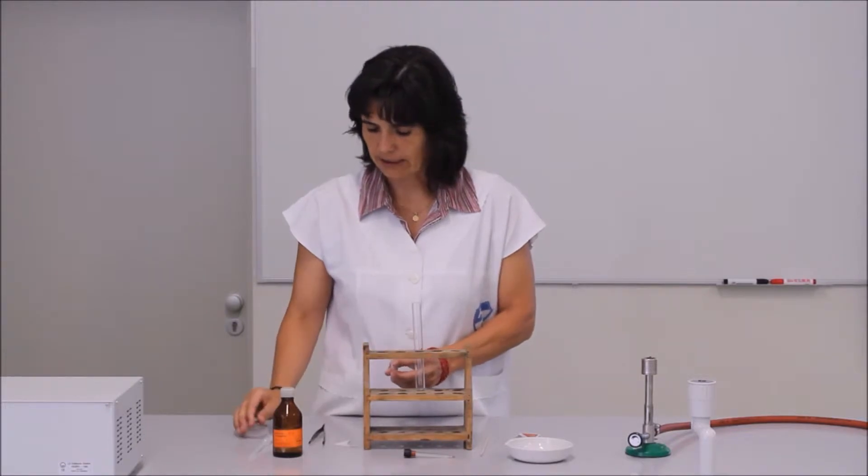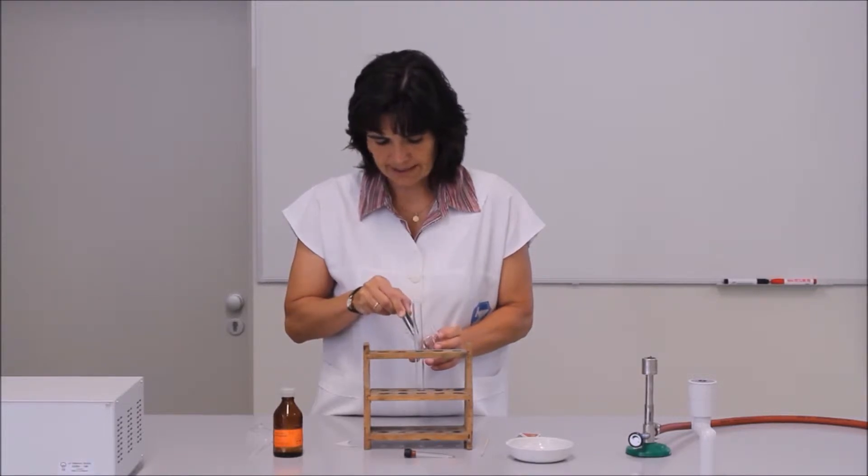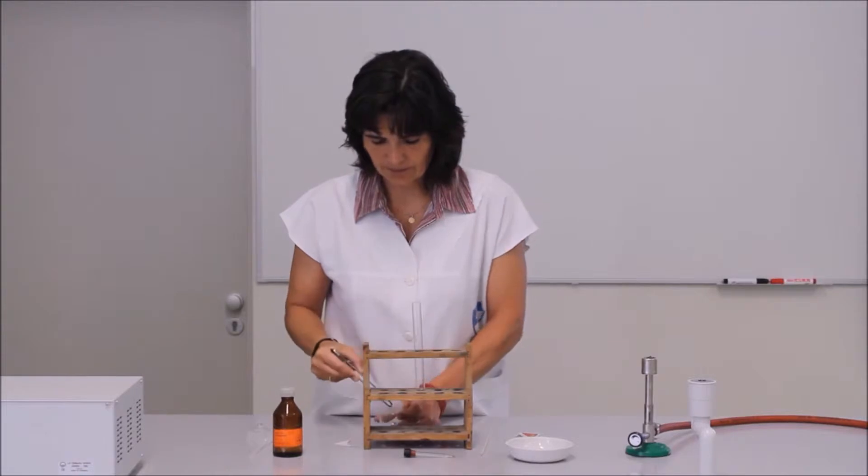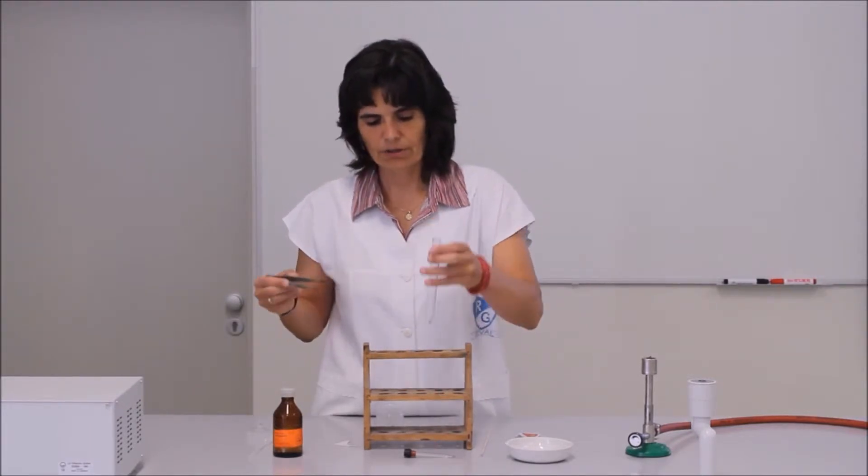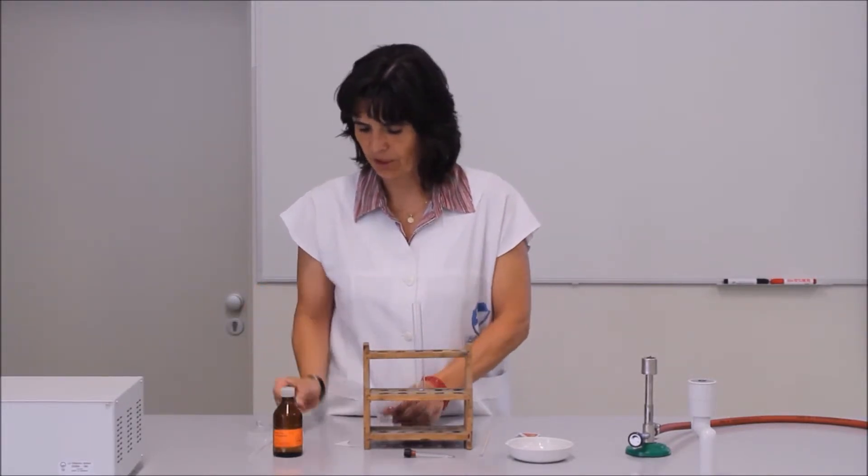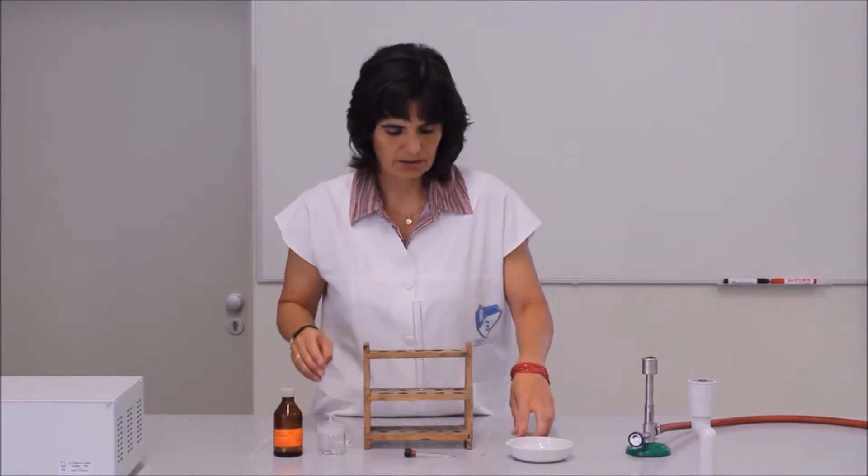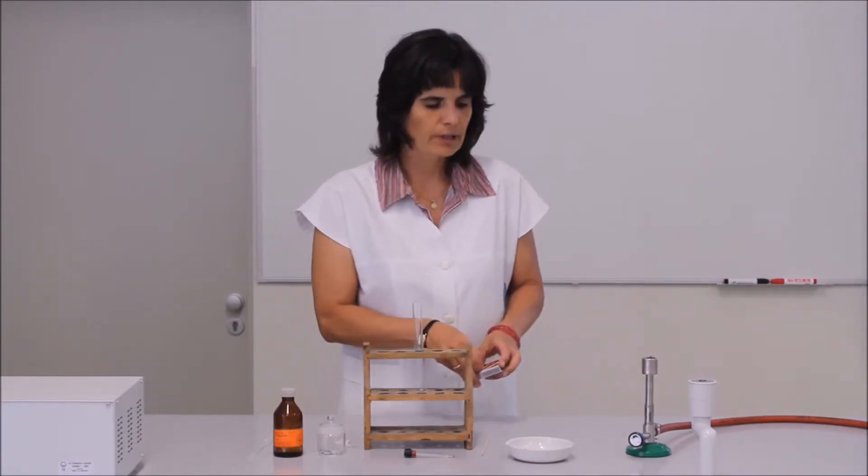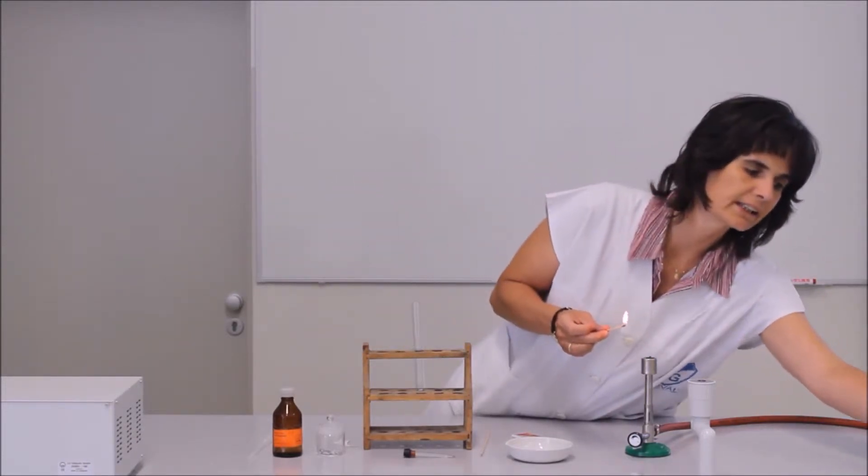A hidrogéngázt laboratóriumi körülmények között legegyszerűbben úgy állíthatjuk elő, hogy cink darabkára sósav oldatot csepegtetünk. Finoman engedem bele a kémcsőbe, hogy ki ne üsse az alját. Közben beállítom a bunsen égőt.